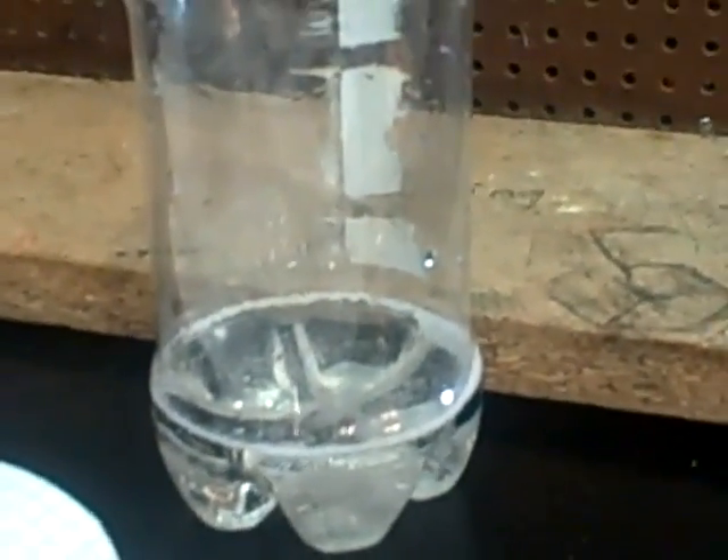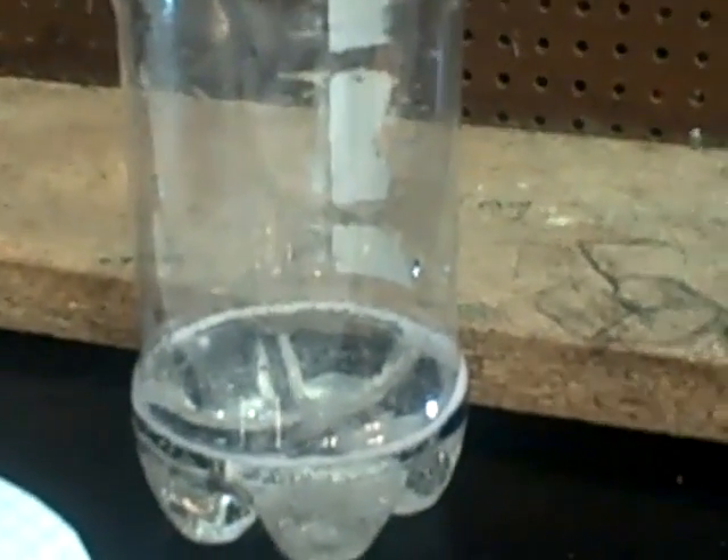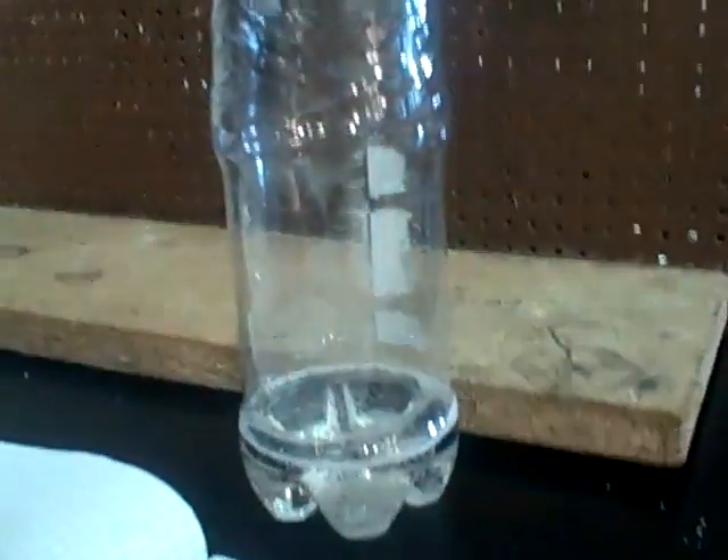I think it's done. We conclude that there's no change in mass, right? Our Alka-Seltzer has just finished fizzing in our bottle.